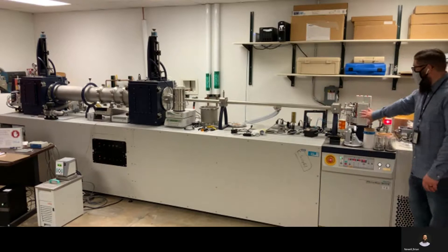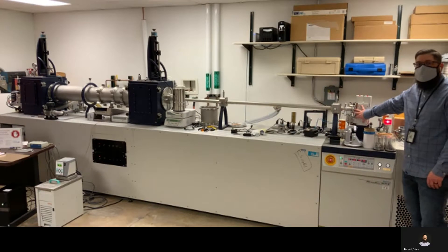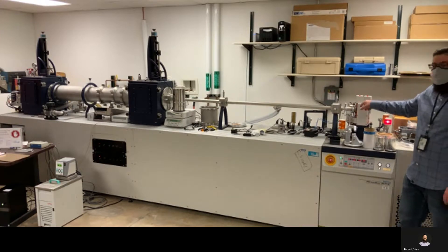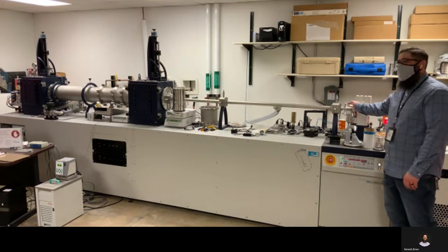We'll start with the generator over here. We have a copper rotating anode that's rotating at about 4000 RPM. We're then hitting that with basically a stream of electrons to generate our x-rays.